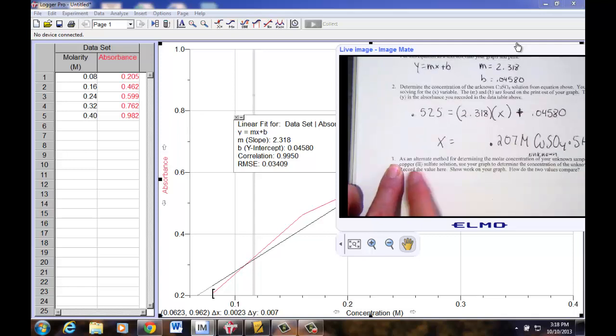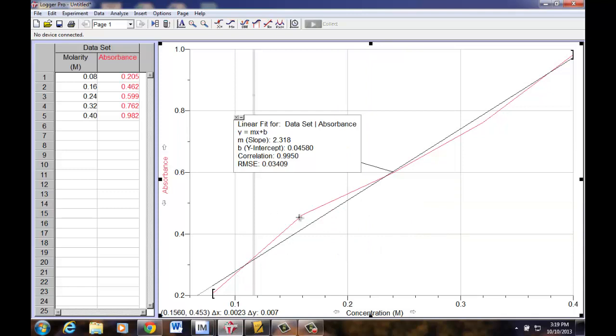Now let's kind of process number three. As an alternate method for determining the molar concentration of your unknown sample, what we can do is use our graph to determine the concentration of the unknown. Record the value here, show the work on your graph, and how do the two values compare. So here's what I'm after. Notice that my red line is my actual data. When I place my cursor on the red line, I want you to bring your eyes down here. It's telling you the X and the Y values. Bring your cursor to where the Y value matches your absorbance reading. Mine was 0.525, so I'm just gently sliding it until the Y matches 0.525. On my red line, 0.525 on my line, not the best fit slope, but the line that you actually generated. It's going to take a soft touch to kind of move around.